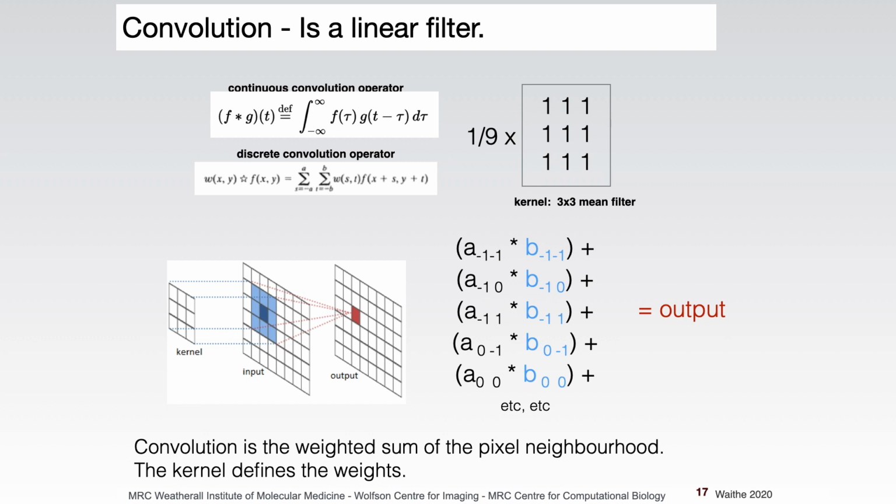Go on. What is that kernel number? Why is it a 1? And is that an input that I can change? Absolutely. This is a mean filter, the most basic filter. You just take a 2D array of ones, and for every pixel in the output, it samples all of its neighbors, and the output represents the average of all of those surrounding ones. So it's the most basic kind of smoothing filter that you can have. Each location has an equal weighting for that particular output. Imagine you're moving this around the whole image, so every location in your output is now an average of its surroundings from the input.